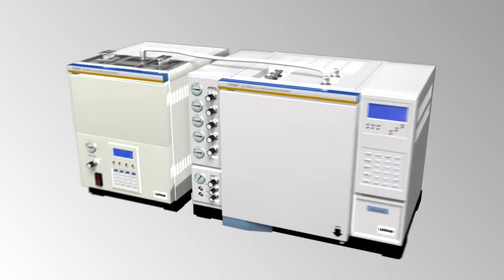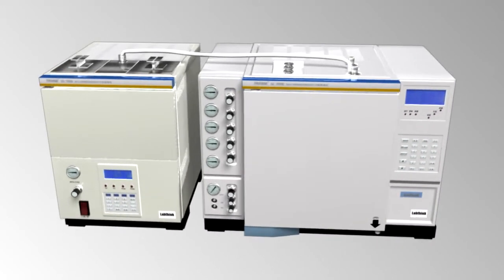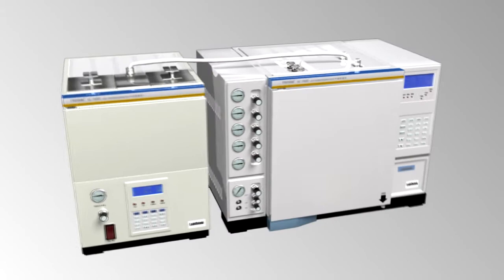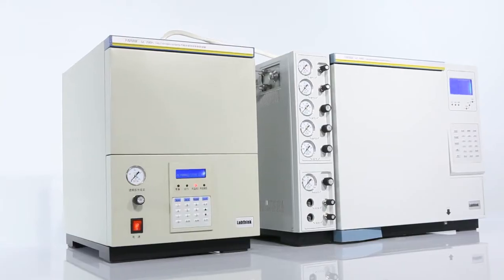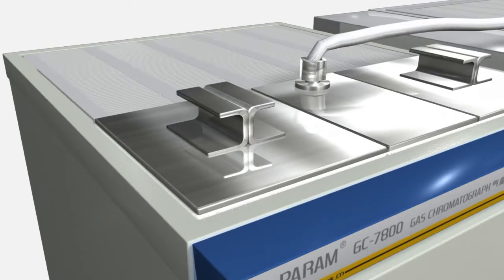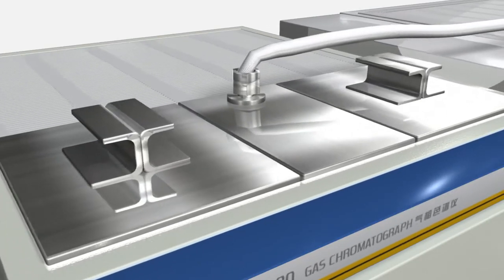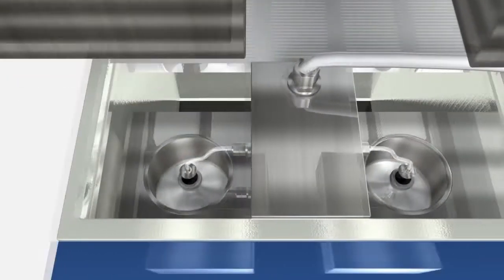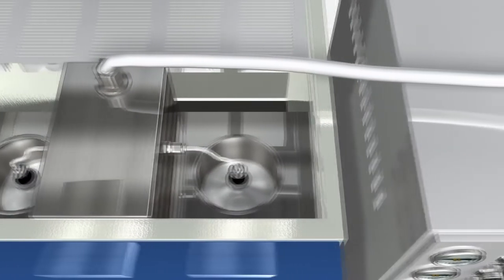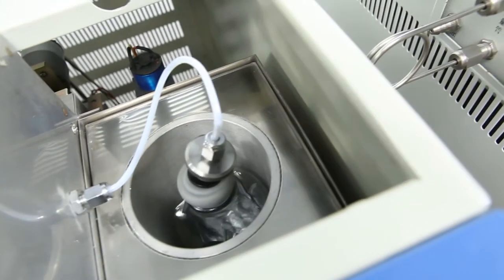The system consists of an auto sampler and a GC7800 gas chromatograph. The auto sampler has two large volume thermostatic chambers. This device can perform automatic sample injection and testing of two different samples in a predetermined order.